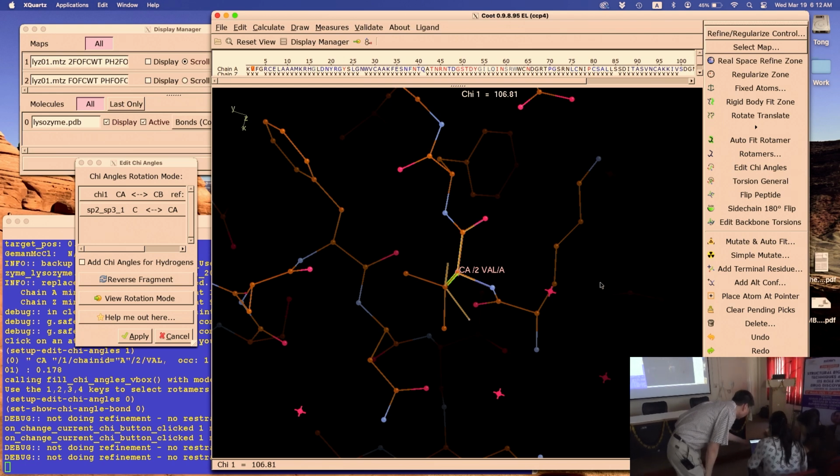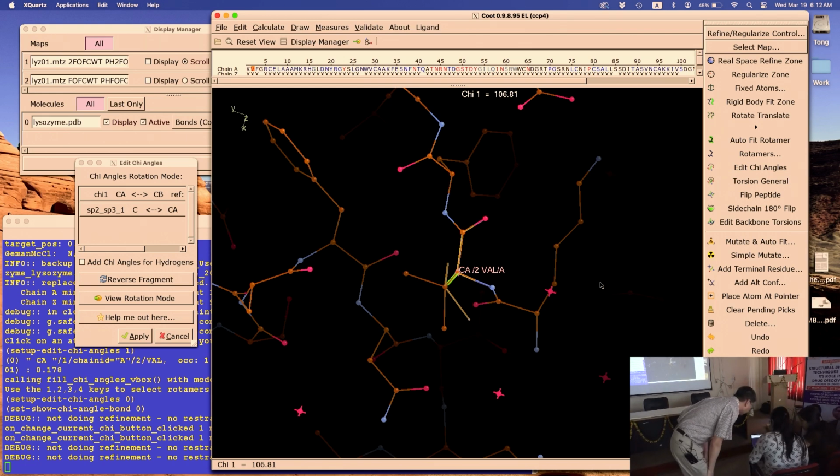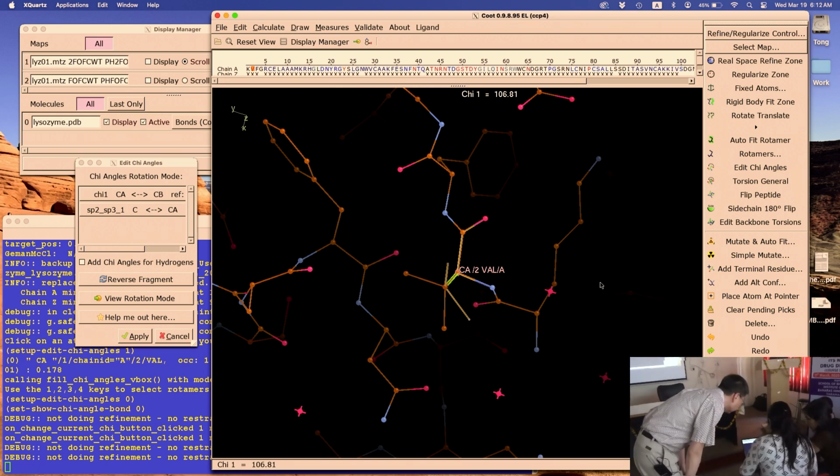Yeah, select that, maybe click it twice. Yeah, and then go back here, go back here, graphics window. Click on somewhere in the graph, no, just don't close it. Go back to the graphics window.